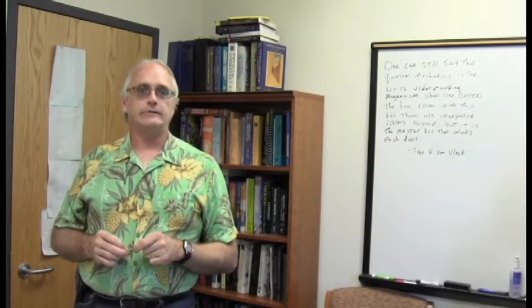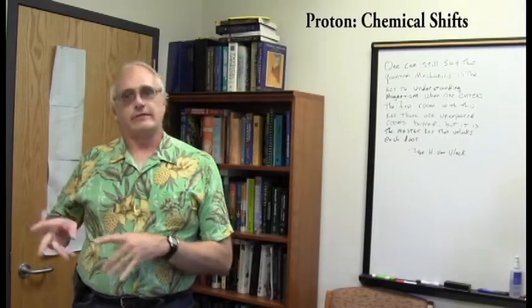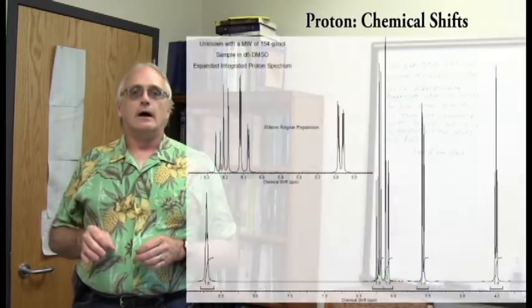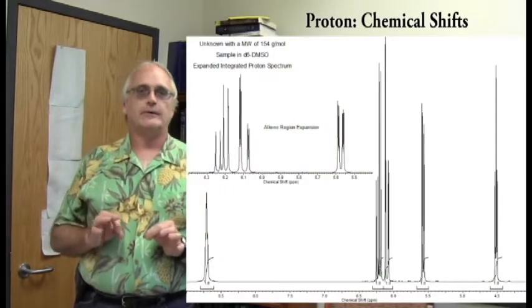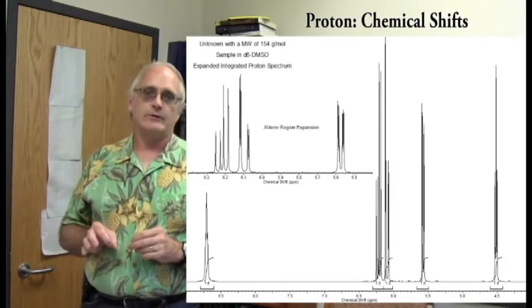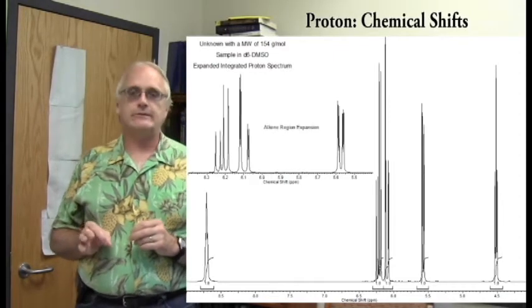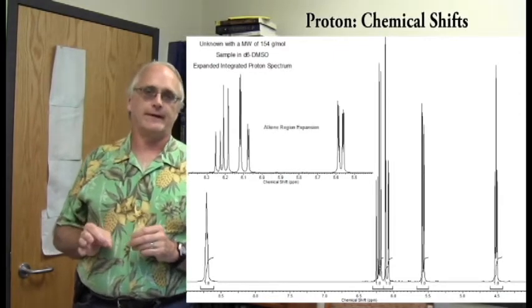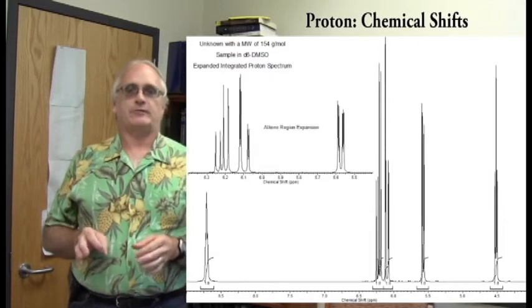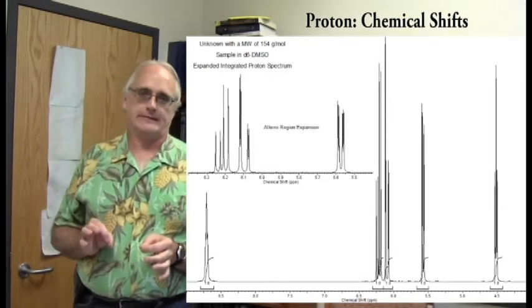Now we turn our attention to the chemical shifts. There are no signals outside of the solvent and the water upfield from this one here at 4.5. And the most downfield peak is over there at about 8.7 ppm. There are no other signals further downfield from there. So this sample has pretty de-shielded protons in it. There's nothing highly shielded in this thing.